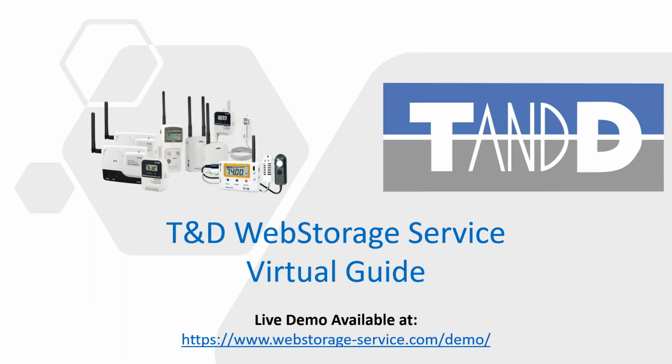In today's presentation, I'll be taking you on a virtual guided tour of the T&D WebStorage service and provide you with a basic tutorial for getting the most out of your data loggers. I'll cover how to add a device, view and download data, set alert preferences, review alerts, and more. Also, if you are interested in a hands-on experience, check out our free demo at the link on your screen. For the purposes of this virtual guided tour, we'll be going through the demos as you can see here.